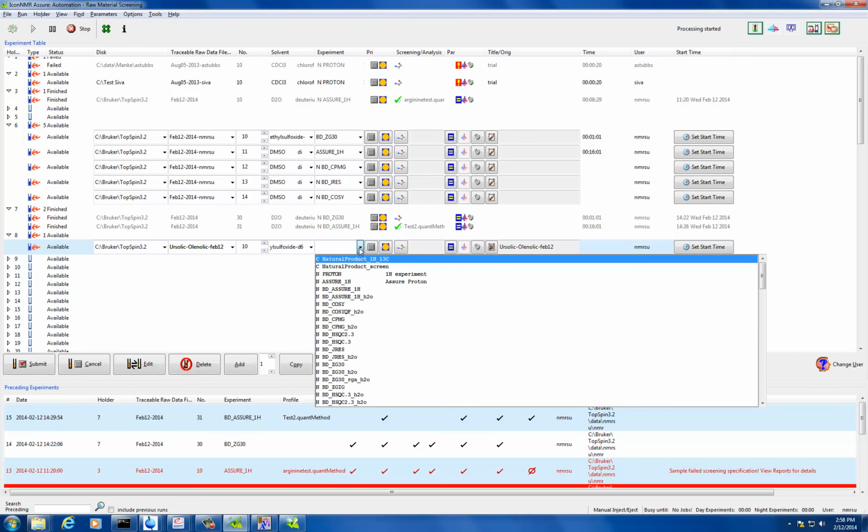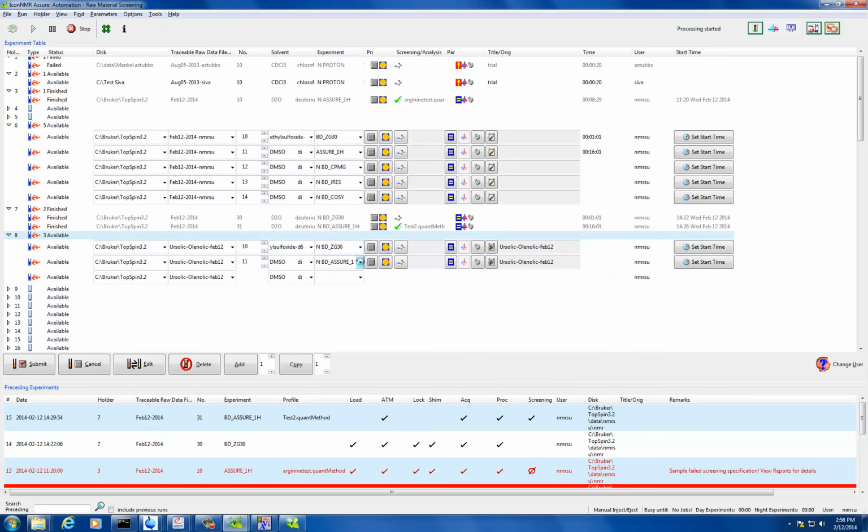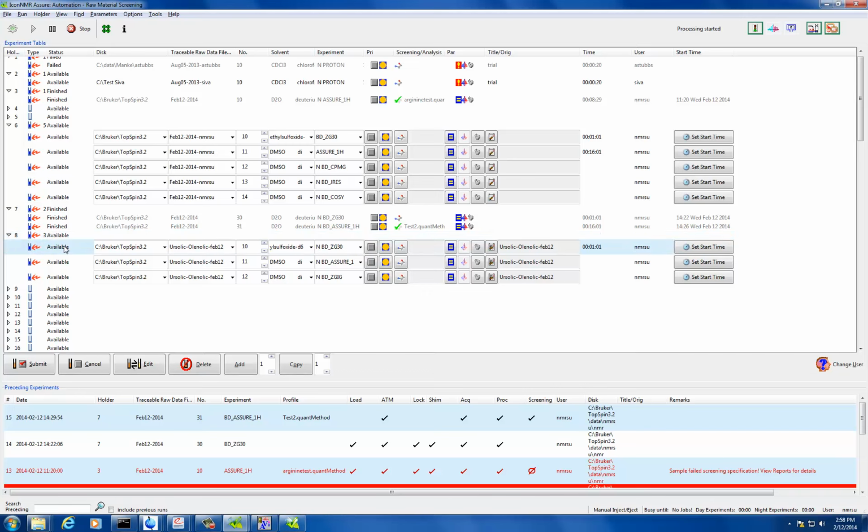We need the database. What do I add? So let's just do a natural product screen. No, sorry, the proton carbon, and we're going to take away the carbon. Click on available near there. It basically highlights that row. For the ZGIG, yeah, and then click delete. Yeah, those two are good. You just want a quick scan, or you want detailed analysis? Because if you click on this one here, right now it's set on 64, which is like 5 minutes. This one's 16 minutes.